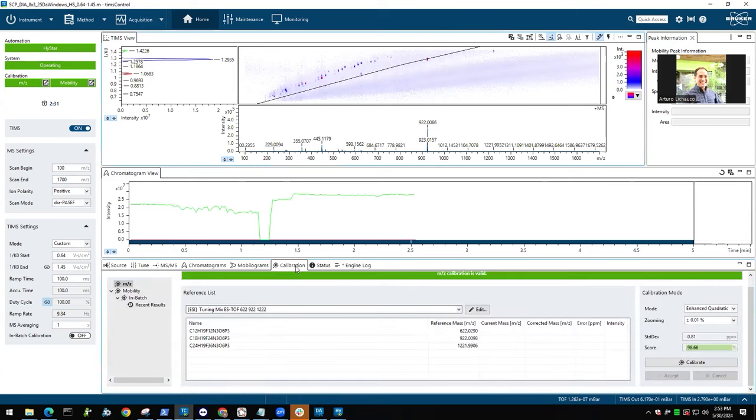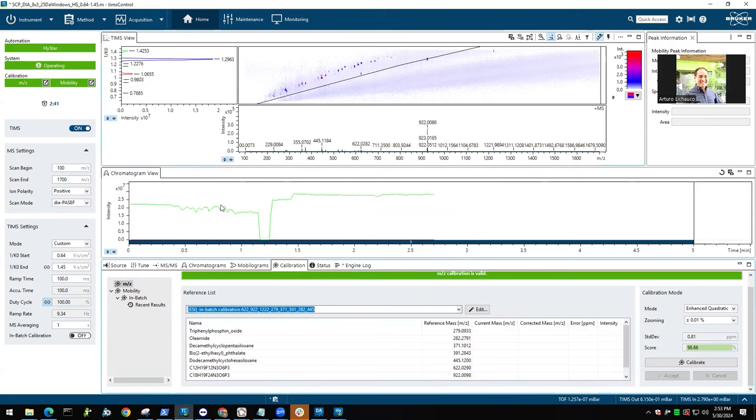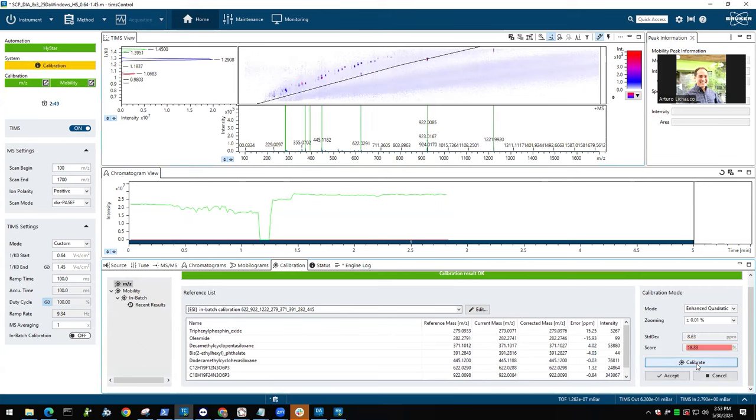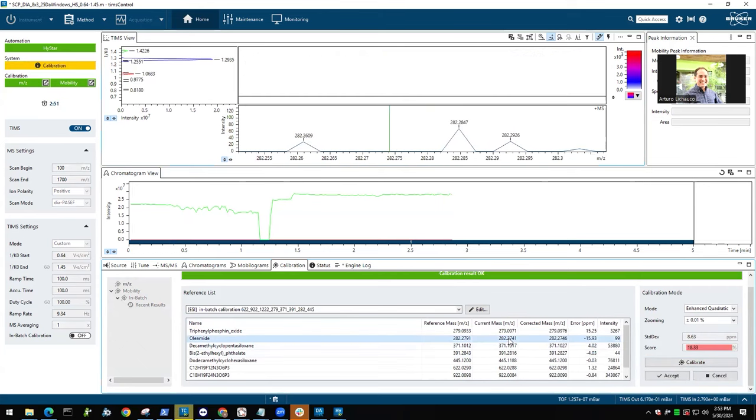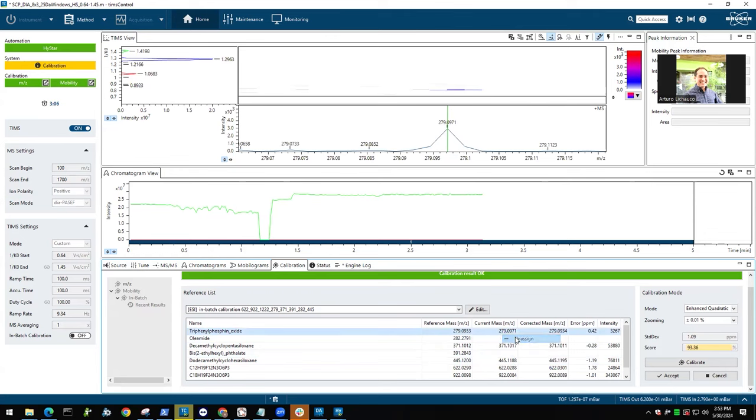So we go to the calibration tab. And here are different reference tables you can select from. This one is the in-batch calibration, as we call it. It has some of the common room contaminants on it. I just click calibrate, and there are some which we don't need here. These are certain polysiloxanes, or this is an oleamide. This is not present, so I remove this one, I remove this one, and I probably also remove this one.